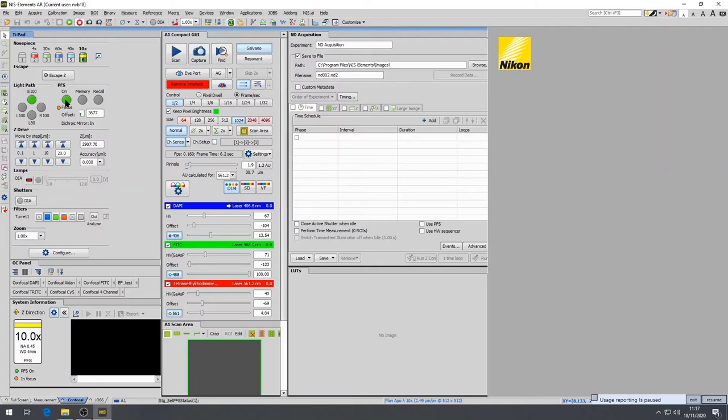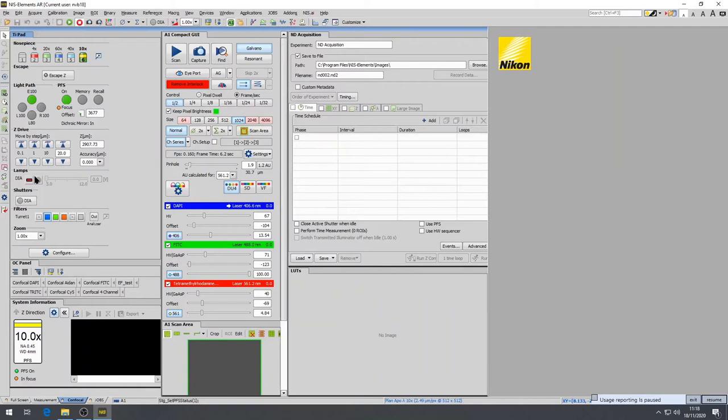Underneath the PFS you find the lamps, the dial lamps. This sidebar controls the halogen lamp allowing you to find the samples with your eyes. Below this section you can choose the filter cubes.